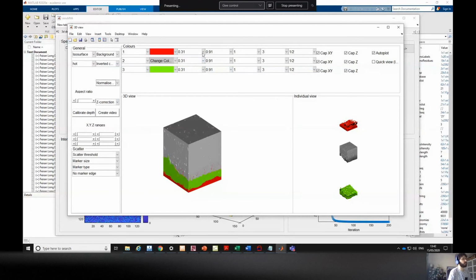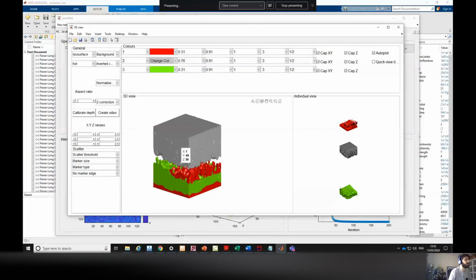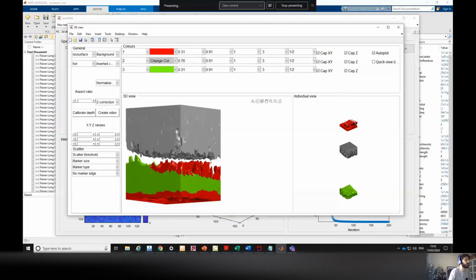That's because those isosurfaces are based on these two values here. Again, it's not obvious because there are no labels yet, but you go from 30% to 90% of the intensities for the red, and the same for the other. So you can tweak this. If you only want to show from 80 to 90% of the gray, you change here, and then it will do fewer isosurfaces. So it's a combination of isosurfaces. It's something that you couldn't do with the surface lab. So to me, this is very useful.